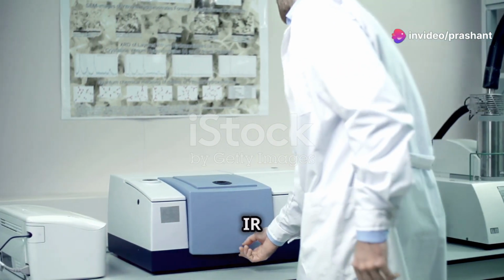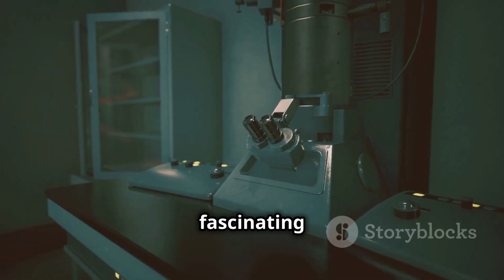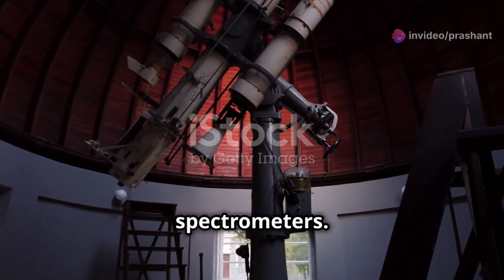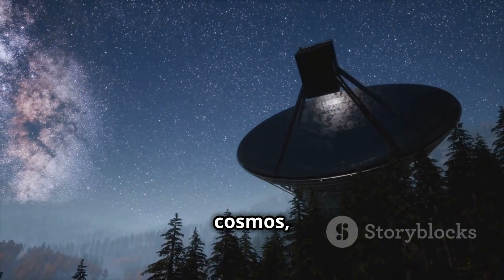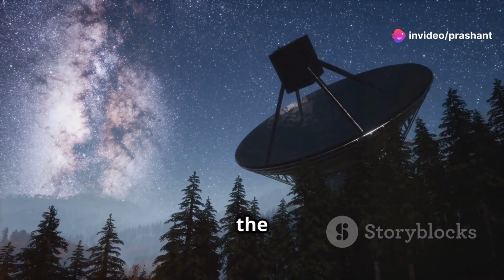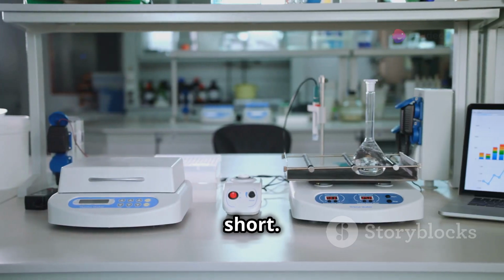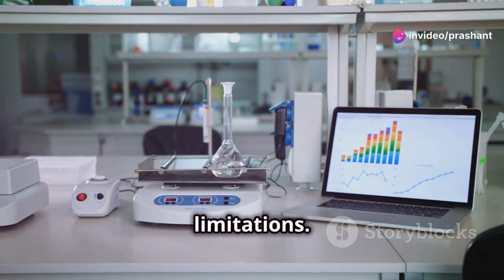Section 5. Types of IR spectroscopy, from dispersive to Fourier transform. In this section, we will explore the fascinating world of infrared spectroscopy and how it has evolved over time. Just like there are different types of telescopes to observe the stars, there are different types of IR spectrometers. Telescopes come in various forms, each designed to capture different aspects of the cosmos, from radio waves to visible light. Similarly, IR spectrometers have been developed to analyze the molecular world in unique ways. Two common types are dispersive IR and Fourier transform infrared spectroscopy, or FTIR for short. These two methods have distinct mechanisms and applications, each offering its own set of advantages and limitations.